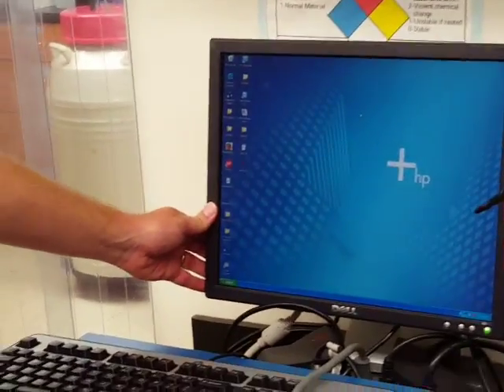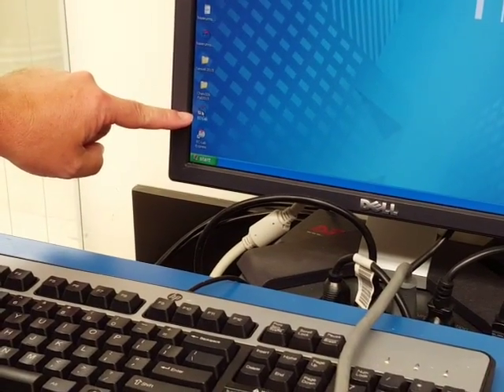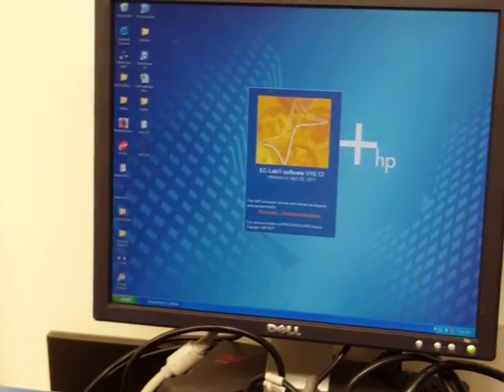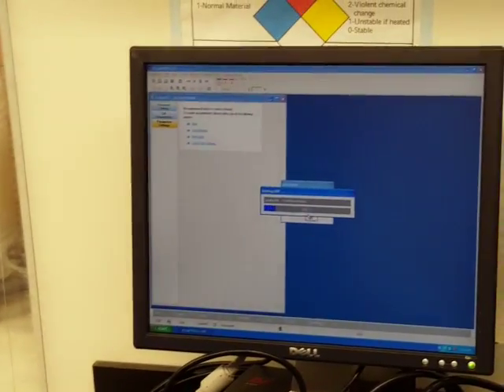Alright, so the first thing we're going to do is open our software, which is EC Lab, okay? Double click on it here, open the software. I mean, the computer was having issues, so maybe this will be a short video. We don't have to put in a username.